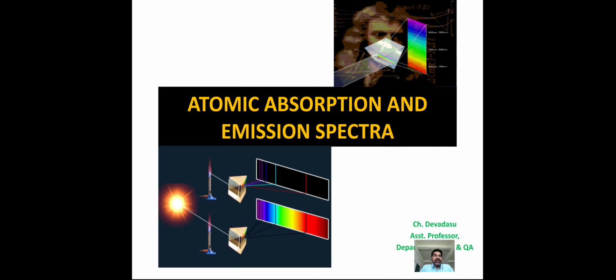So in this video, how atomic spectra, both absorption and emission spectra, are obtained, what is the theory behind, and what is atomic absorption and atomic emission spectroscopy.